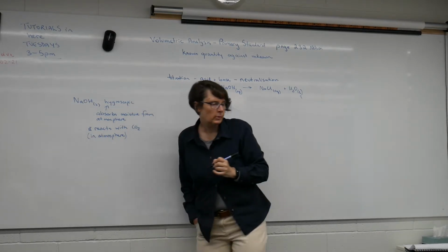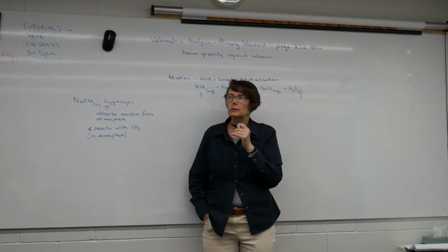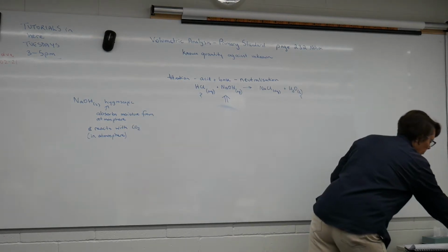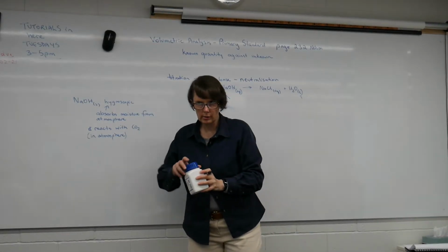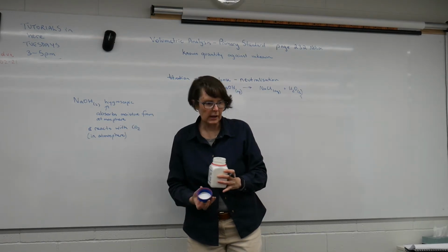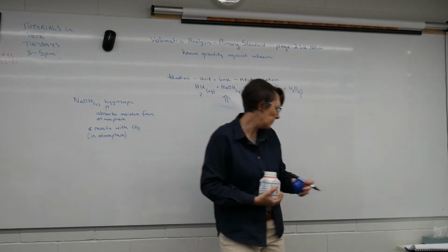It also will react with carbon dioxide in the atmosphere. So that means that, and I've got you some sodium hydroxide pellets here. And I've given you all a piece of paper towel for your desk so that you can just have a look and see what happens.